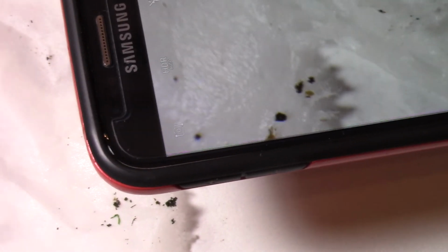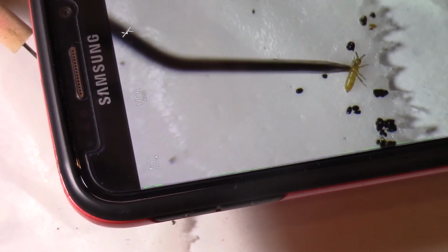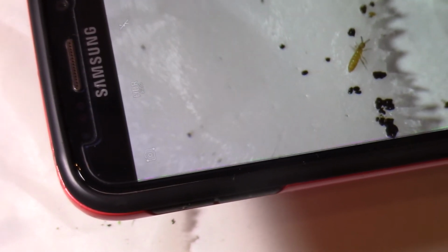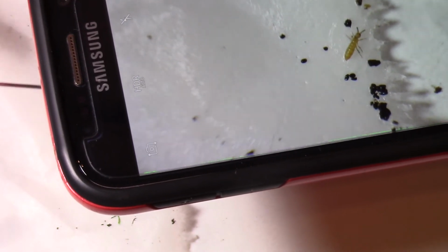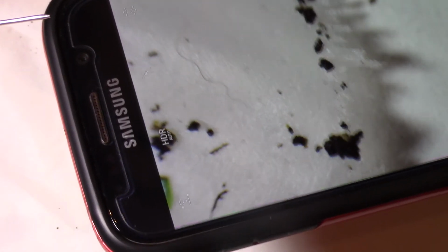Where's my probe? Yeah, definitely springtail. Can you guys see that? Oh, I gotta take a picture. I've got little antenna, 6 little legs. I love it. Awesome. What else can I find? So mesofauna is definitely doable with this microscope.